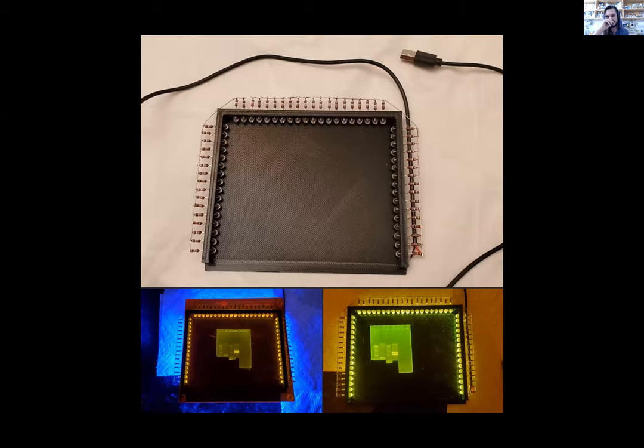I 3D printed a design, soldered it all together, and then I spent about 3 weeks buying different acrylics to try to figure out what light filter they used, because the blue light transilluminators require a blue blocker to block out the excitation wavelength so you can see the fluorescence coming up from the gel. The excitation wavelength is canceled and the emission wavelength is coming through, right?